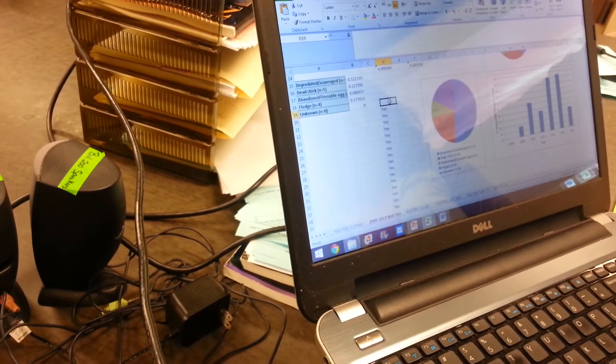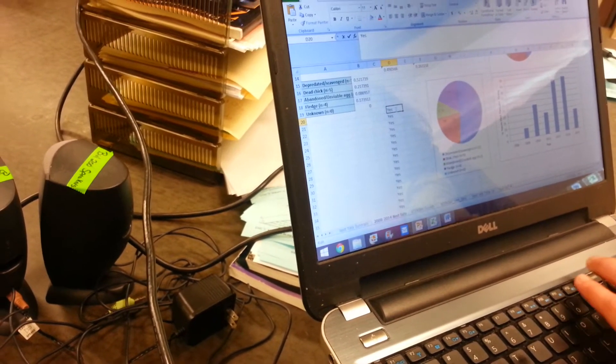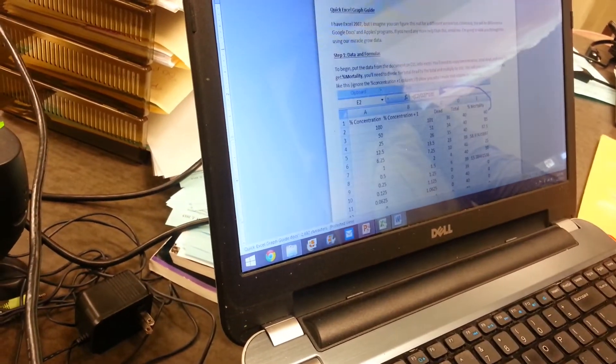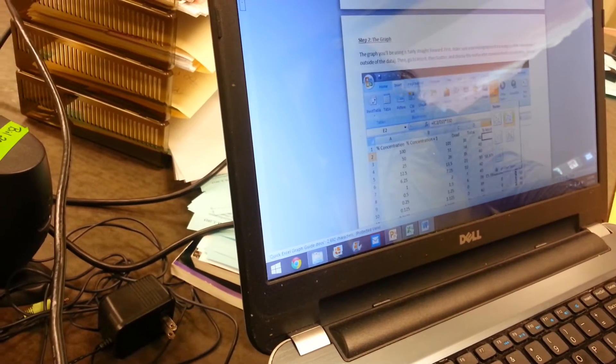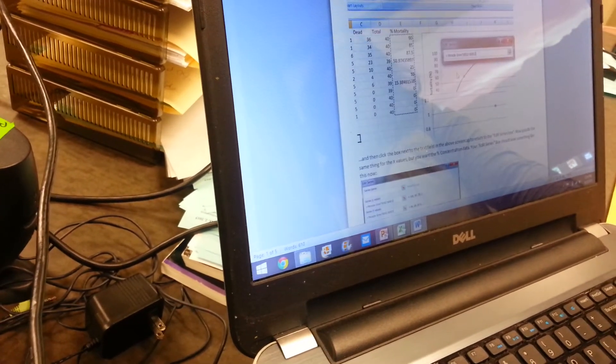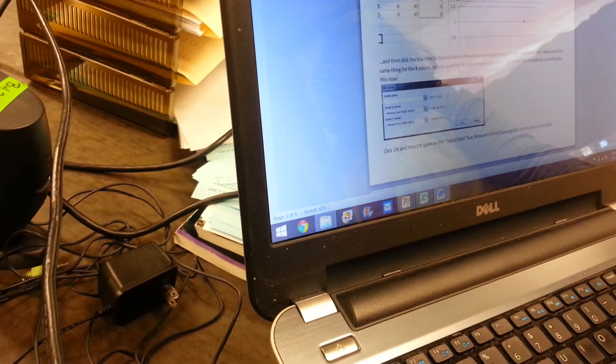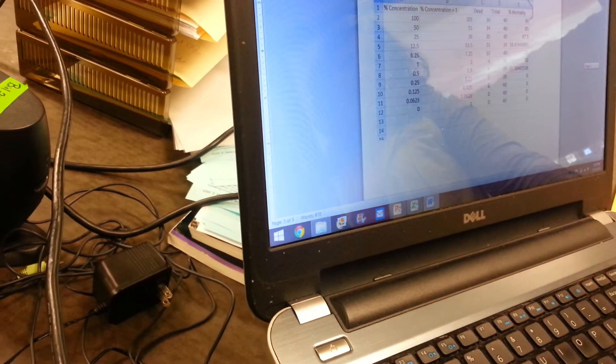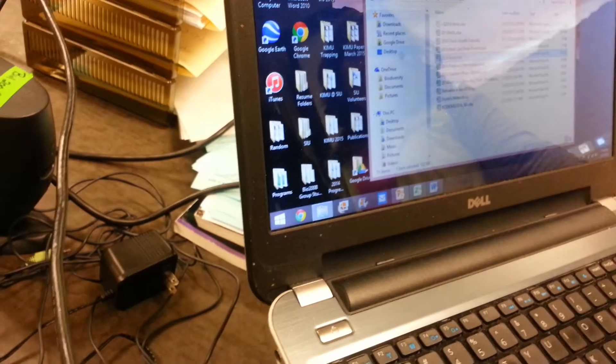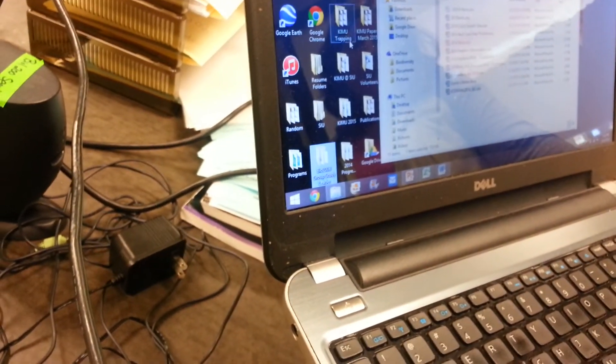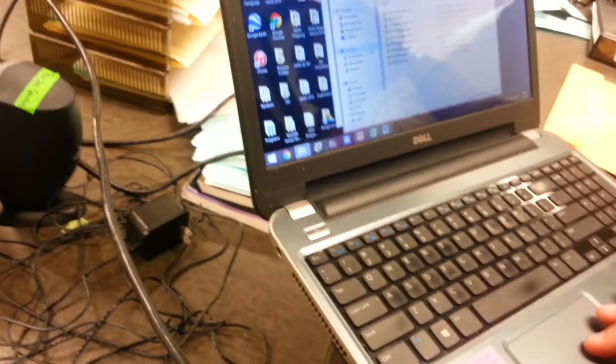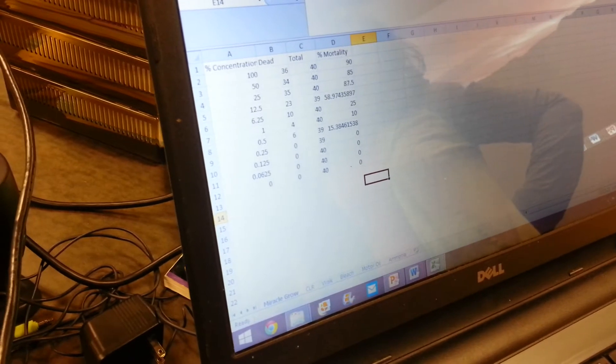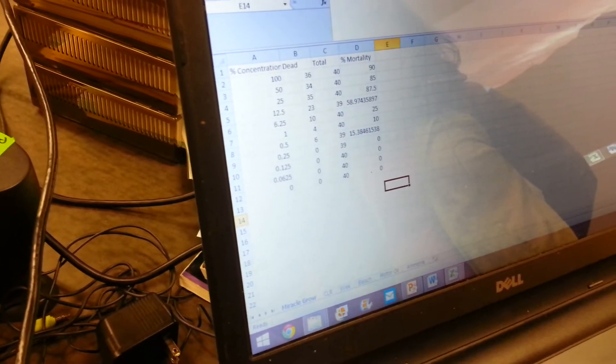How do we get the line of best fit? All right, so to do that you just right-click. I'm just going to see if I can copy some of this data. All right, so here's your guys' data.